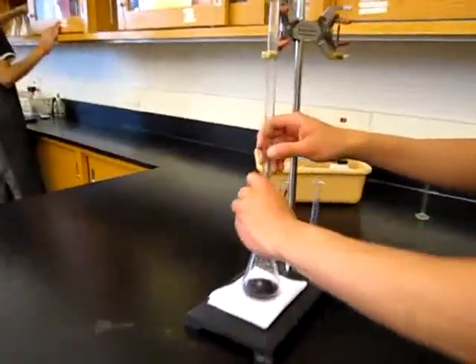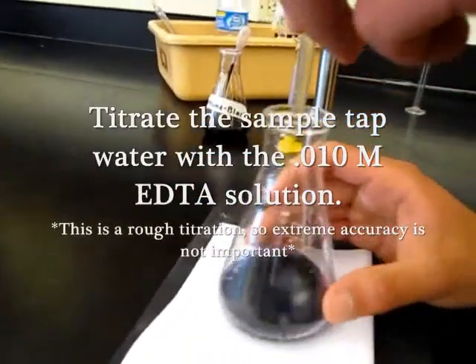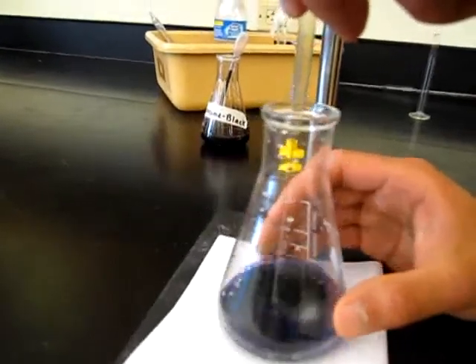Begin a rough titration of the water sample in order to gain an estimate of the volume of EDTA necessary to react with the ions in the sample.